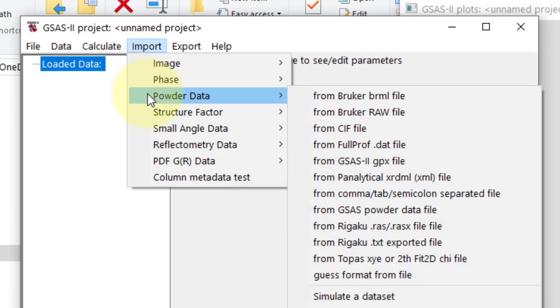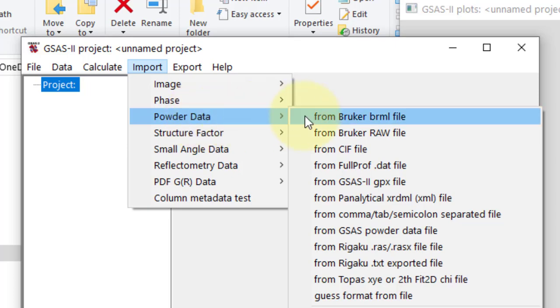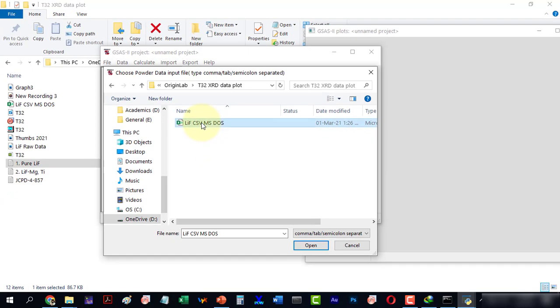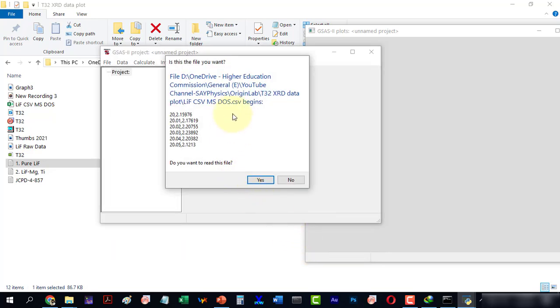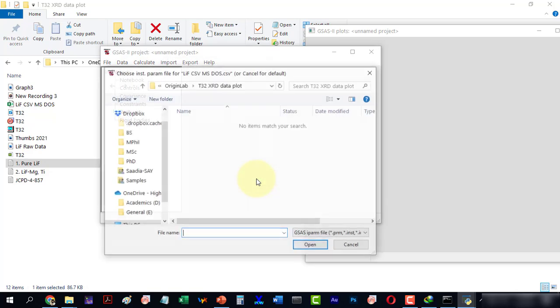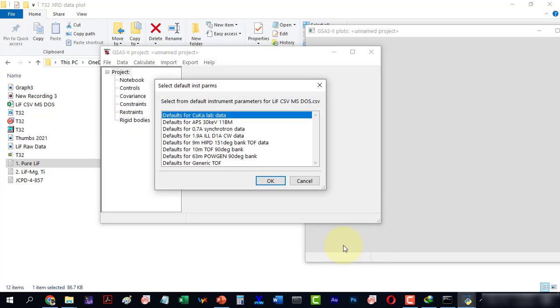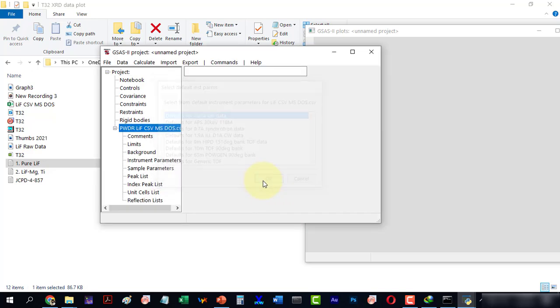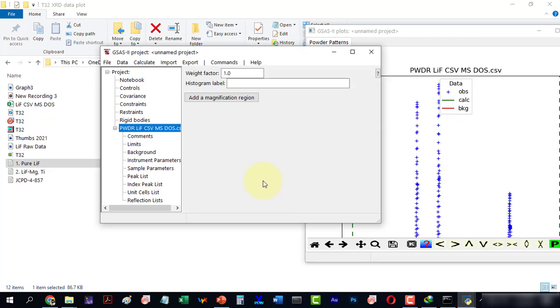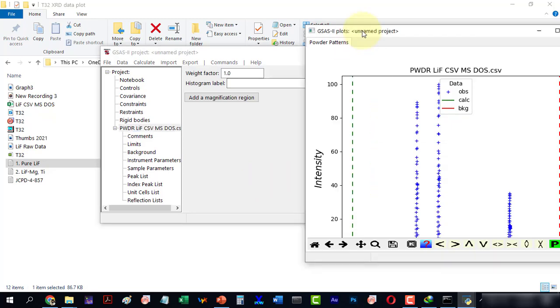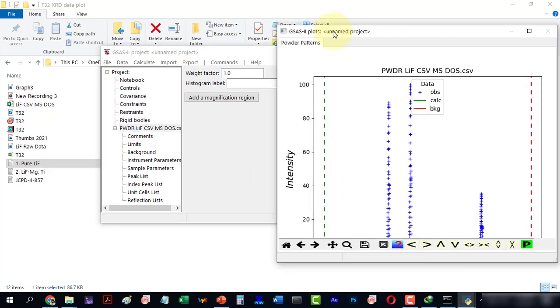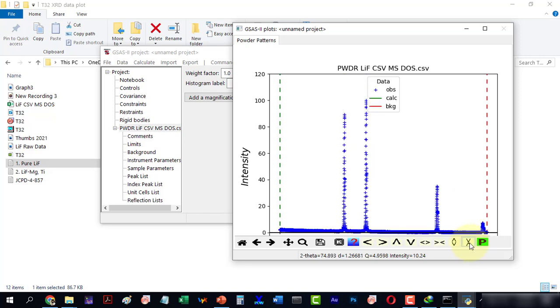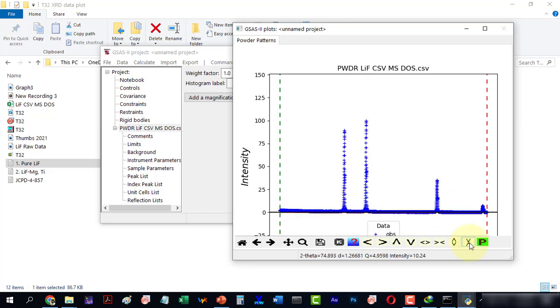I will import a CSV file to check if it is running properly. It will ask for a parameter file, but since I do not have one I will cancel. Now this is the plot of our data. We can resize it by shrinking it a bit.